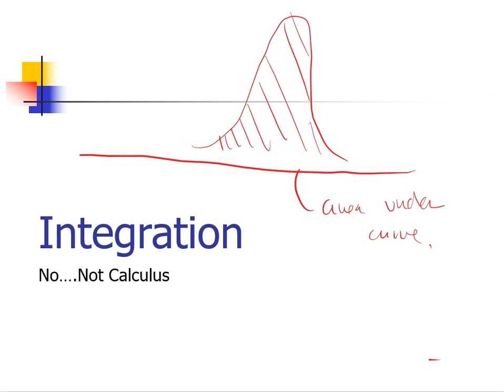And the reason that it does is because we have an NMR that looks like this, and then we get a signal that's coming from that NMR. But if we zoom in and look at that line, it's actually not a true line. It's actually more of an enlarged kind of view like this. It's more like a Gaussian curve in a way. Maybe not necessarily Gaussian, but we could see a very broad foot on this line that we've just been simply drawing as a line for convenience up to this point.